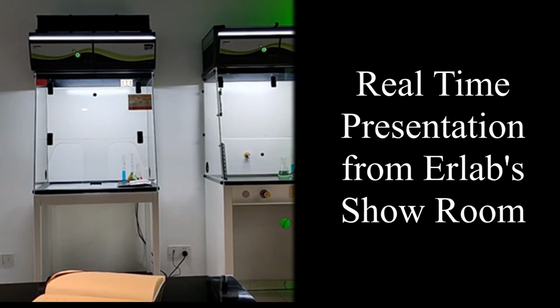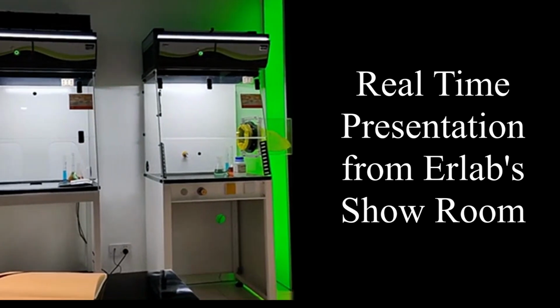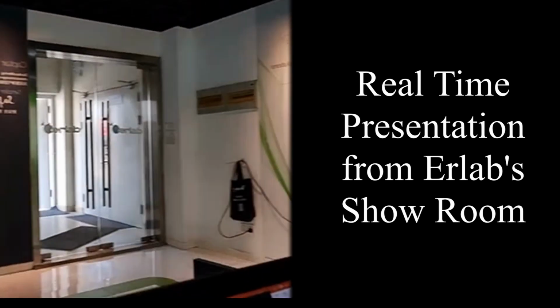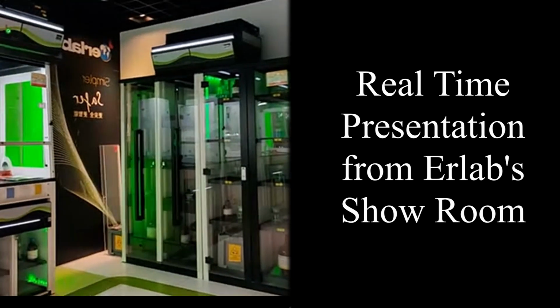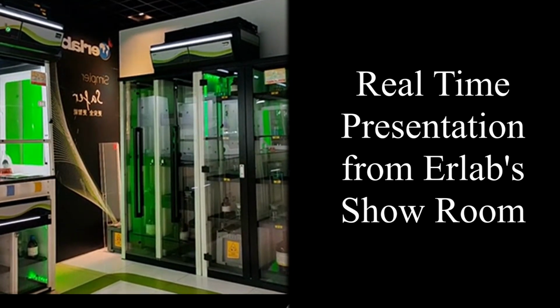So if I turn the image, I will show you the larger enclosures. So wait a minute, I'm moving in the lab. So here you can see the larger size enclosure.